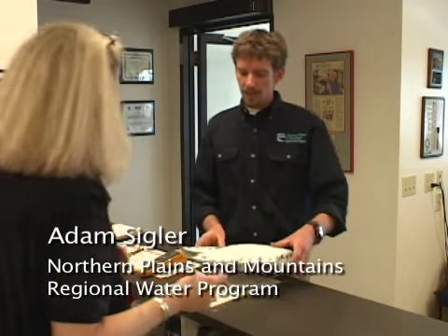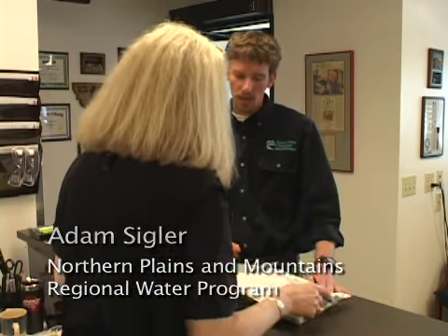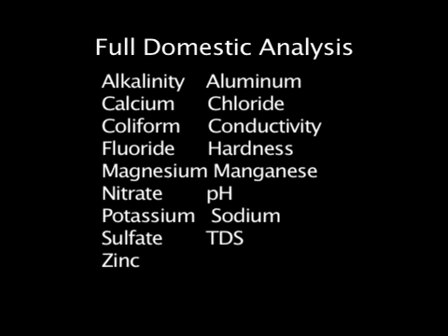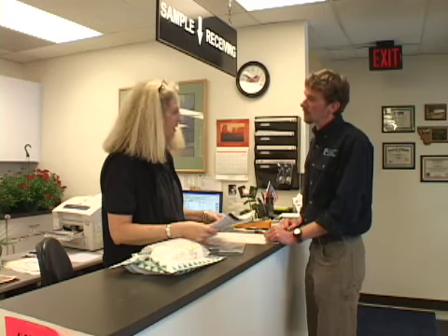Hello. I have some samples here for my private drinking water well. Okay, what are you testing for? I'd like to do a full domestic analysis. Okay. It'll be about 10 working days for this to be finished.